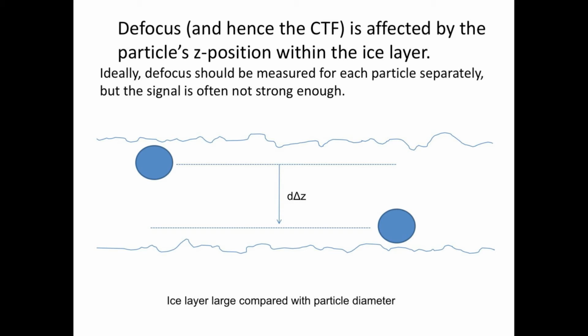So the way to overcome this is by making defocus determinations for the single particles themselves, and some programs are doing this, but there are obviously limits to this, because if the molecule is too small, then the signal is very very poor.